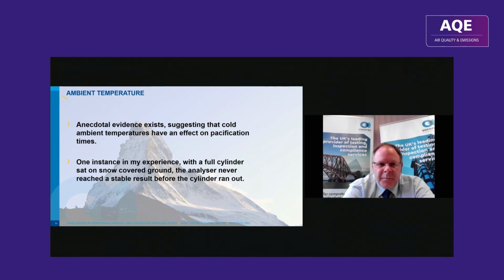And then some fairly anecdotal evidence to do with ambient temperatures. Now, this appears to be more to do with getting the gases from the cylinder. So we've already said that we know that HCl can essentially stick to surfaces. It seems to slow as it passes through stainless steel and as it passes through the PTFE, but it also seems to stick inside the cylinder. And that effect seems to be worse when the cylinders are cold. So if your cylinder is kept nice and warm, we seem to get a faster passivation. If it's particularly cold, it does seem to slow the passivation down.